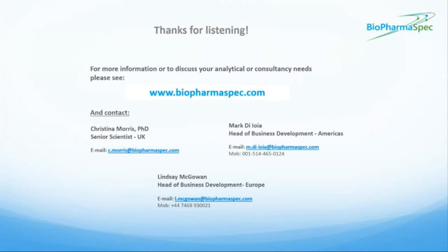ELISA does remain the gold standard, and we would encourage the use of mass spec to cover any of the gaps and corroborate the data. In terms of the HCP numbers, again, it's process and product specific, but there are no absolute control limits. There are some factors to take into consideration. So I would say these include the maximum dosage of your product, the frequency of dosage, the route of administration, for example. Maybe if the therapeutic is topical versus an injectable.